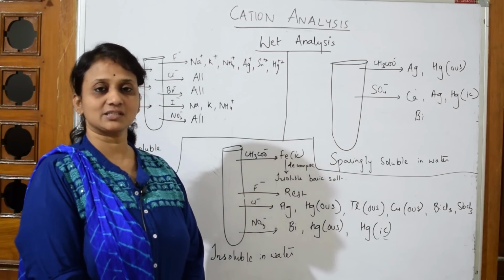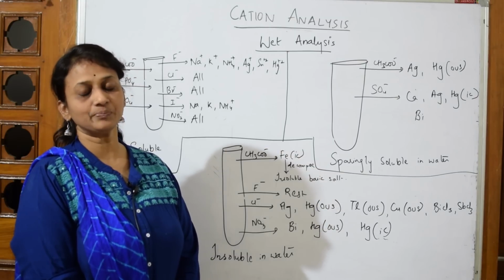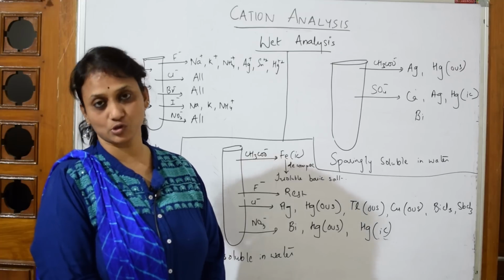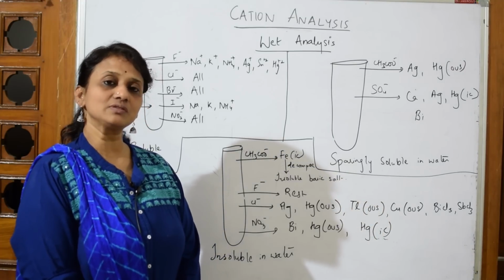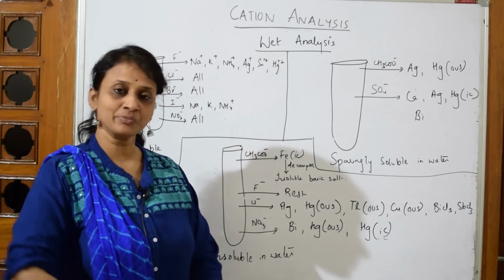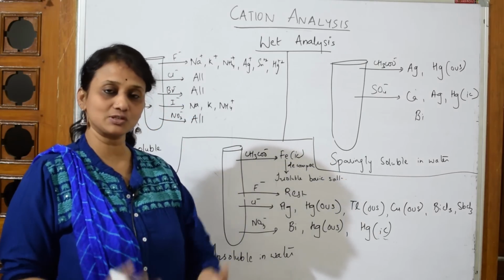So wet analysis, as I told you, will be testing with cold water, hot water, dilute HCl, nitric acid, and sometimes aqua regia also. Done. So most of the schools, they give you water soluble salts. Few add on water insoluble salts also. Not a problem. Sparingly soluble salts also, we'll see.